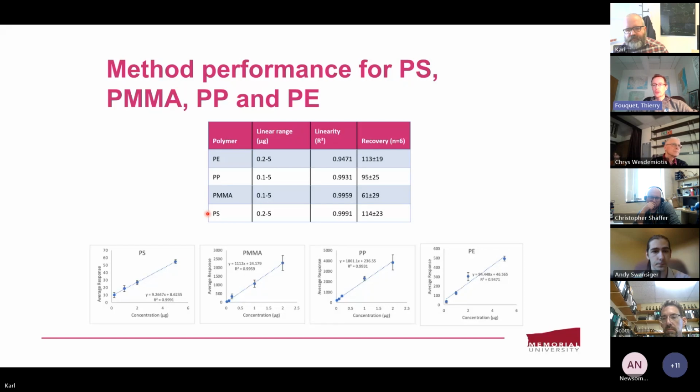I think Luke also had a question. Yeah, I guess we're all going on the concentration question here and the calibration. I think I emailed you about this before, but I was curious, what was the format of the samples being quantified versus the format of the calibrants?